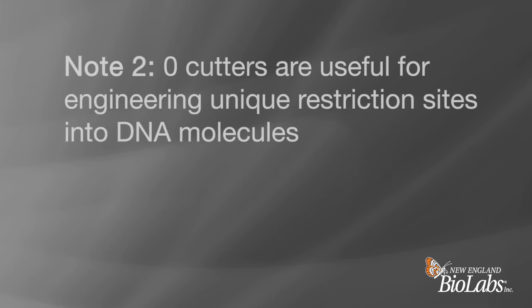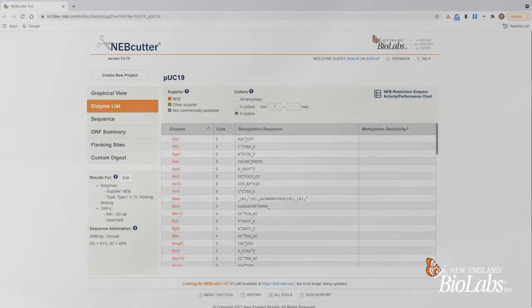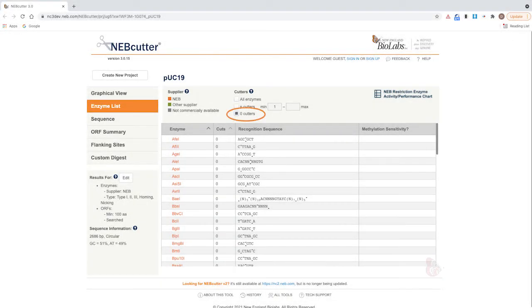Note two: zero cutters are useful for engineering unique restriction sites into DNA molecules. First, ensure that the site does not occur in the plasmid construct. Then, introduce the restriction site flanking the region of DNA to be removed.